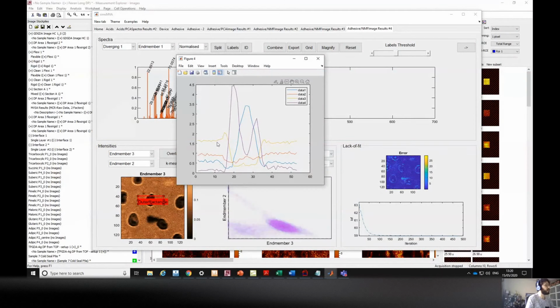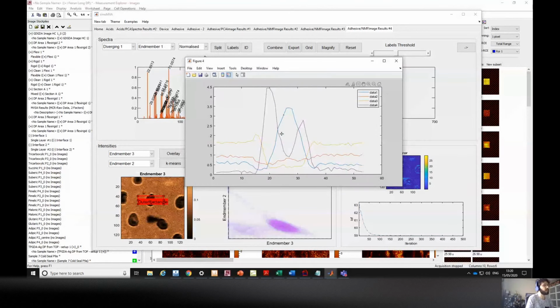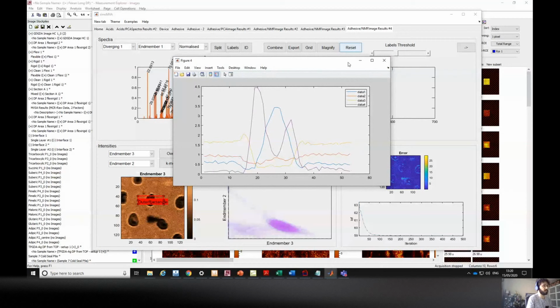It's just different. In this case, I think the image is better to see, but sometimes you want to look at an interface of a material. So you use this signal to identify where the interface is and things like that. It's similar to, in SurfaceLab, where you also have the line scan tool. So now what we're doing is the line scan after we do NMF or PCA.